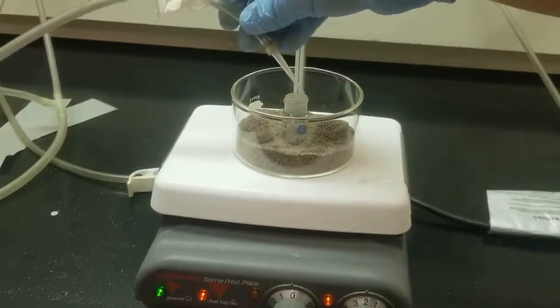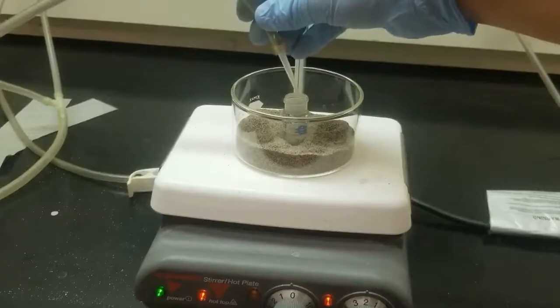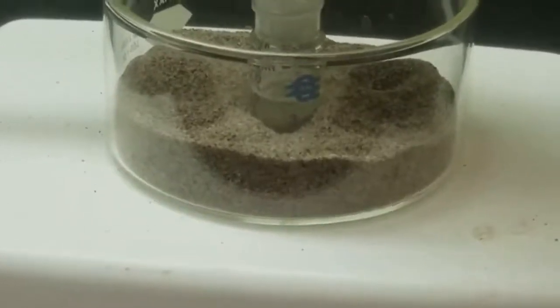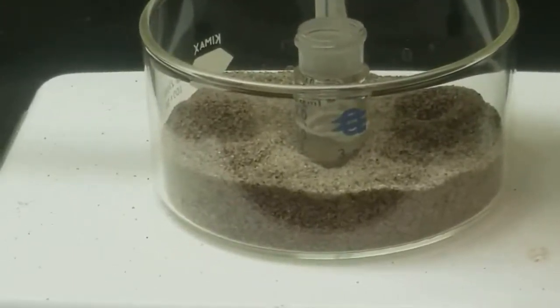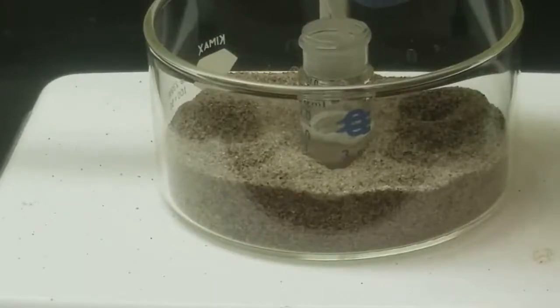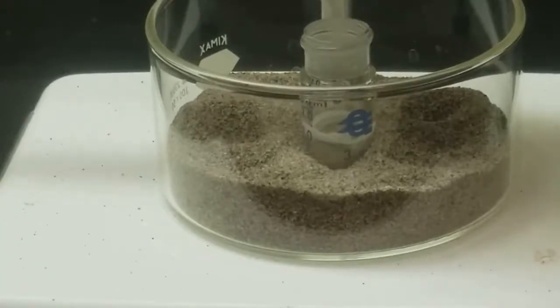Don't shoot directly at the liquid, just shoot at the sidewall next to the liquid. You can see some of the white solids starting to build up.